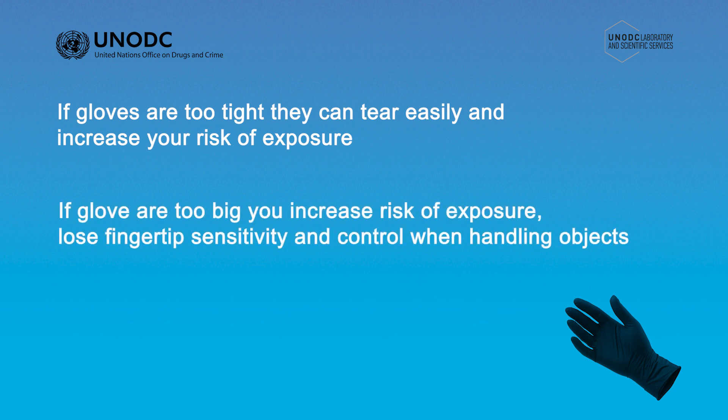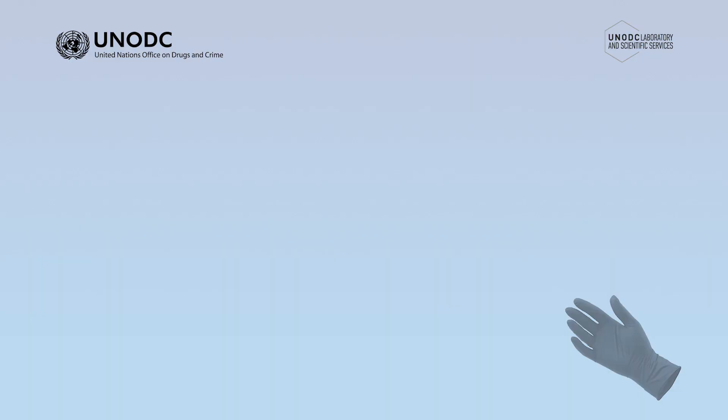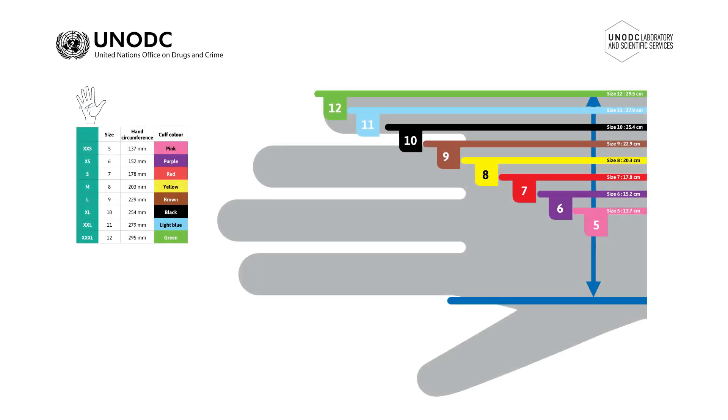If gloves are too big, you can increase your risk of exposure, as well as lose fingertip sensitivity and control when handling some objects. Most glove manufacturers have a sizing guide which can be downloaded and printed. Alternatively, a sizing guide should be printed on the box.